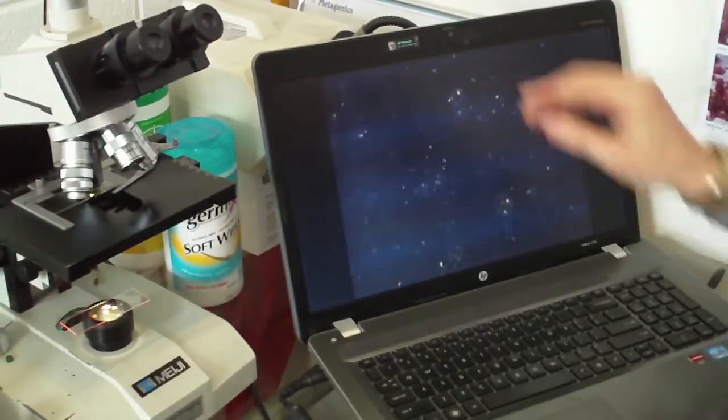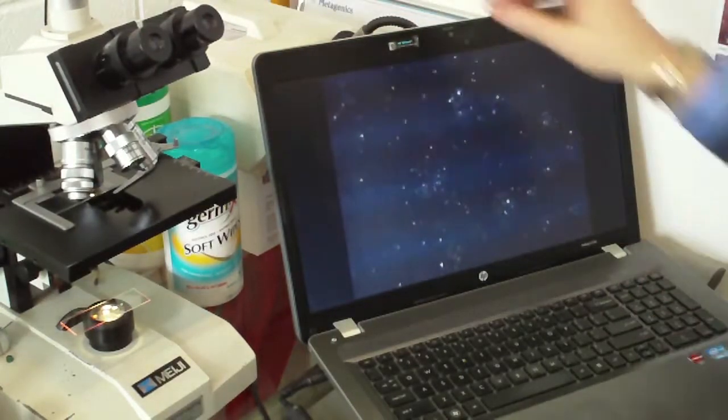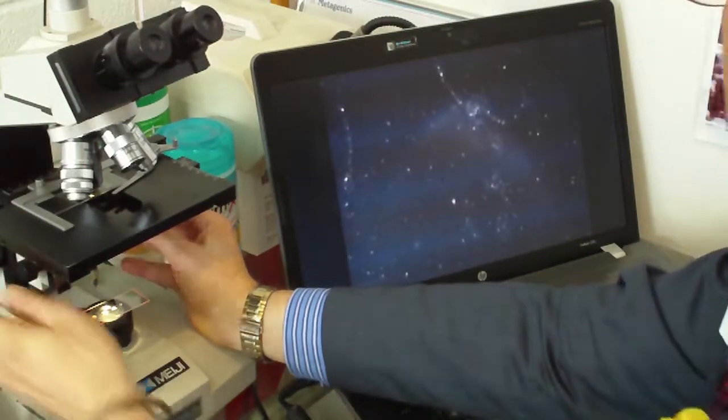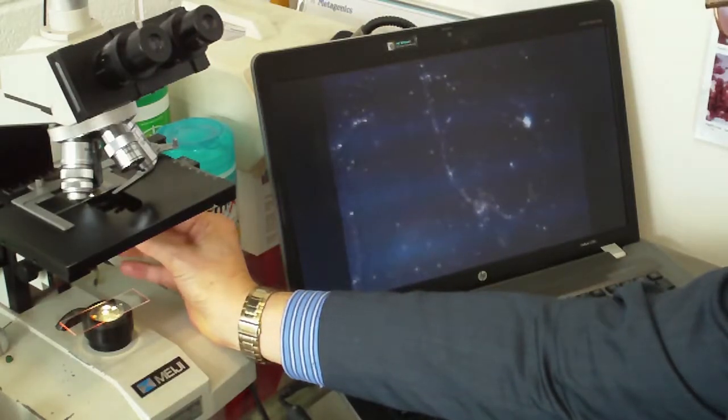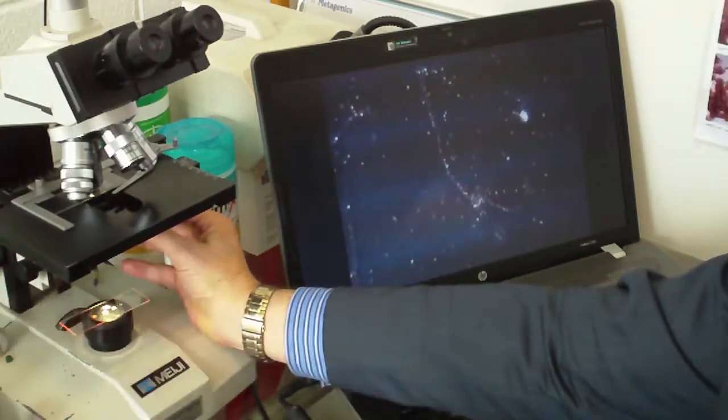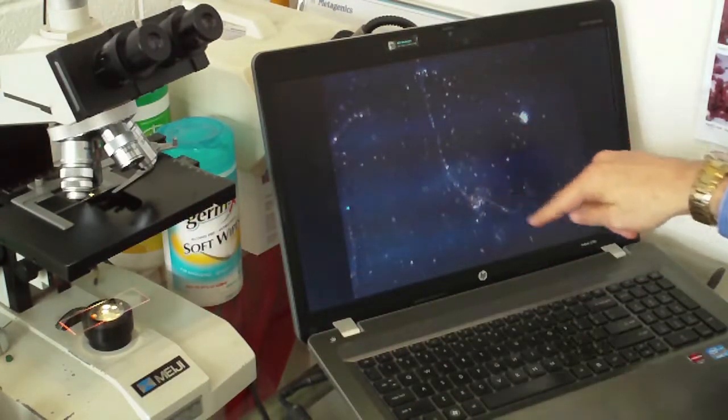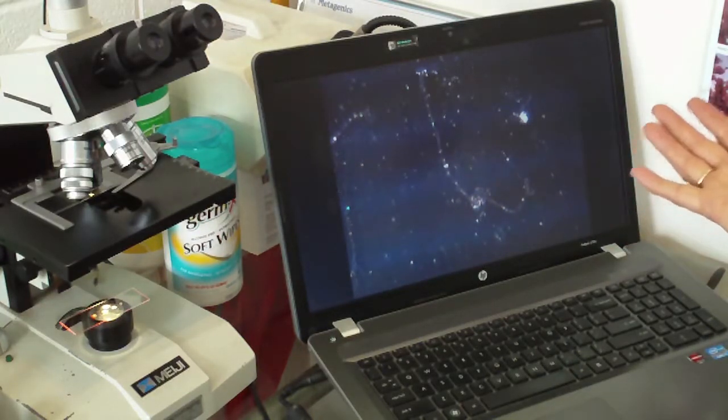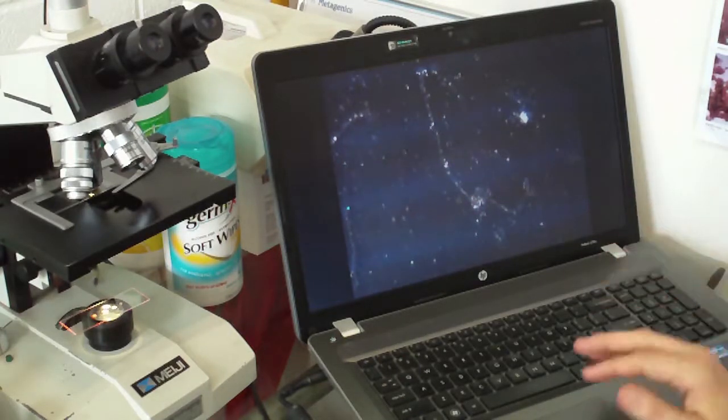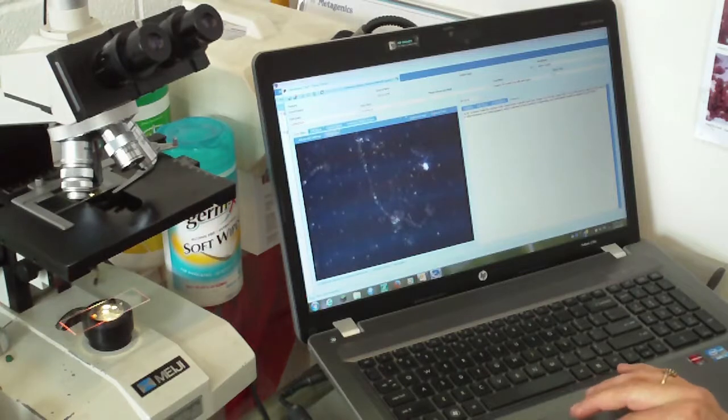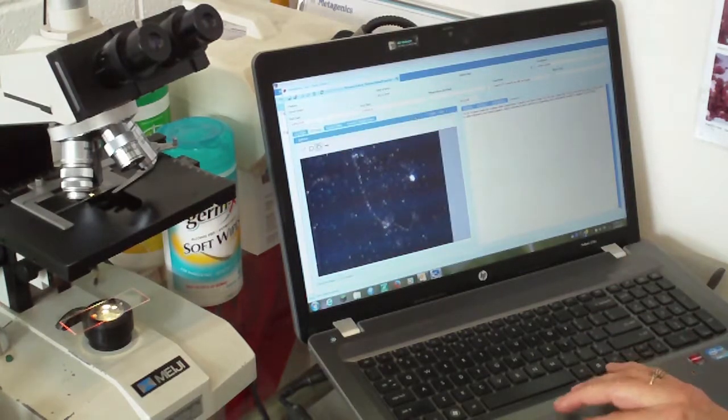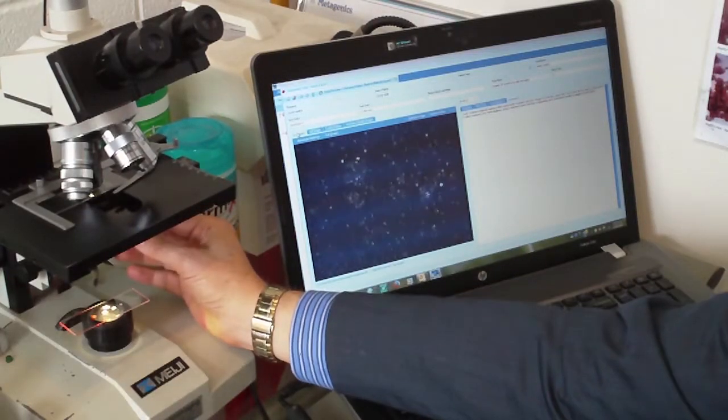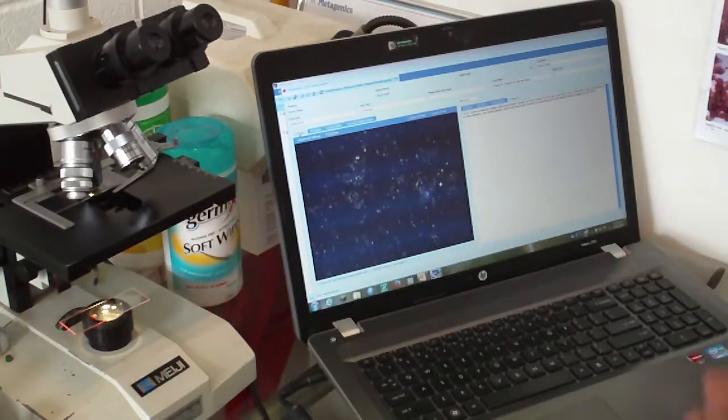And now we can see them uncloaked, so to speak, or unmasked. So I would normally expect to see something that looks like looking at moving in a space. Okay, and here we have the first sign that's abnormal. Now it's not major, it's just a bit of fibrin. If we had a crisscross lattice network of this spindly type formation, then it would mean there's liver damage. But this patient doesn't have that, which is great. This small amount of fibrin is a detox reaction, because the patient's undergoing a detox. So not concerned about this. It just proves the point that the detox is working. Everything else in this blood is pretty normal. You would normally see a few white dots not moving, that's cellular debris and toxins from normal metabolism. And then there's a snow that's sort of moving through the blood.